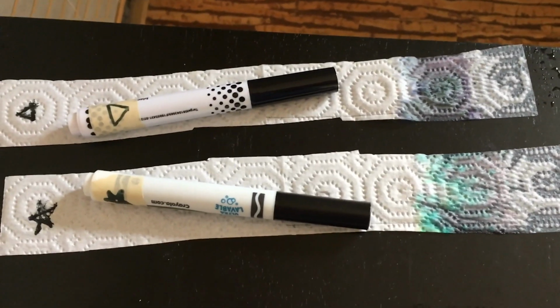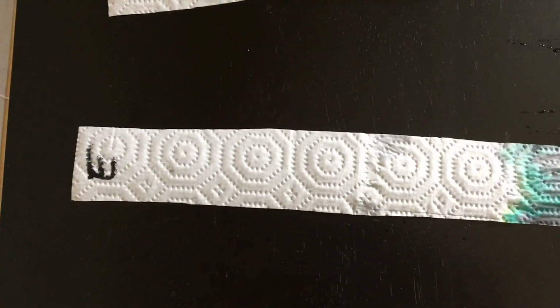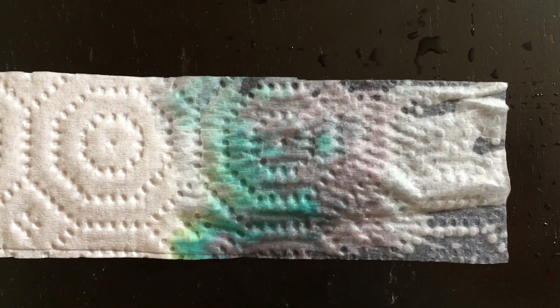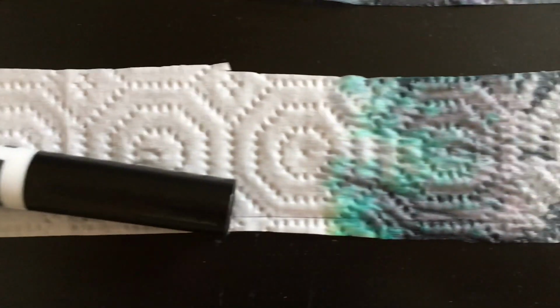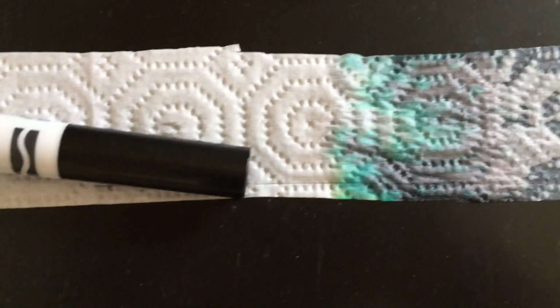So here are the 2 that did something. You can see how the colors have changed going up. And this one is our evidence. So taking a closer look, this is what we want to match. And then we can say, does it match that or that? And we can easily see that with that larger green component, it matches our star pen. So that was the pen that was used to produce our evidence.